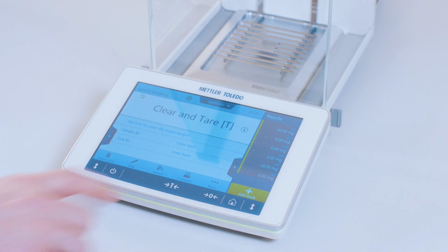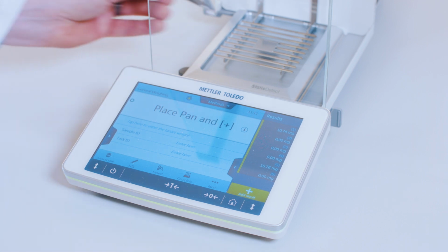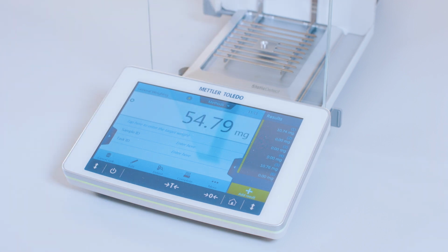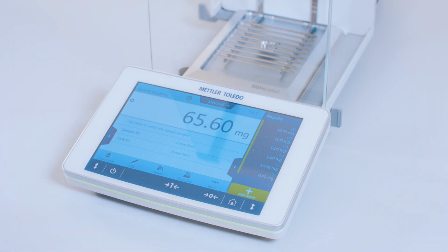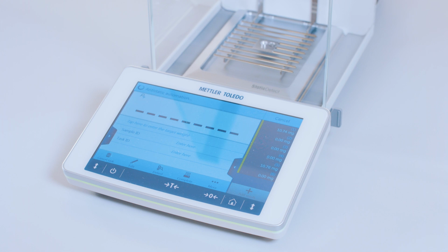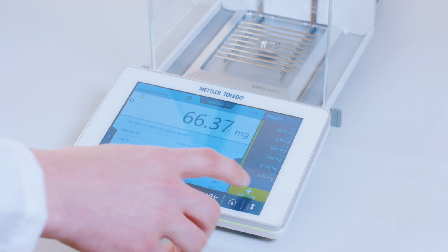Instructions will be shown on the balance screen. To begin, press Tare. If using a DSC 2500, you will be instructed to load a pan and lid. If running in T1 or T4 heat flow, you will skip the pan weighing step. When you are satisfied that the weight is stable, press Add Result. The name and position of the next sample to be weighed will be displayed.